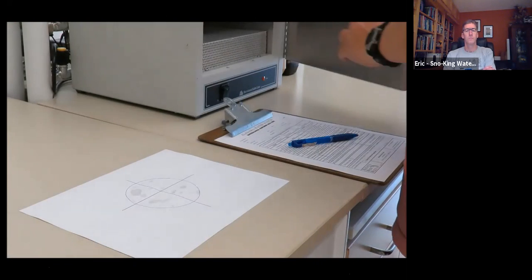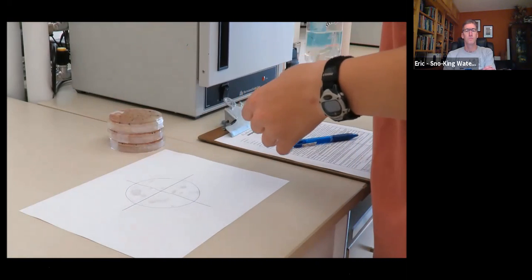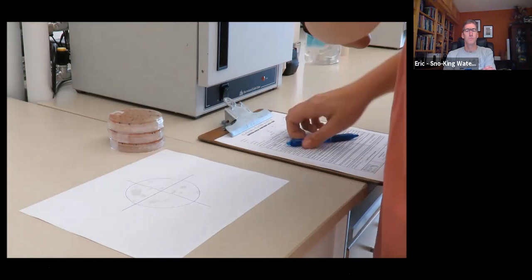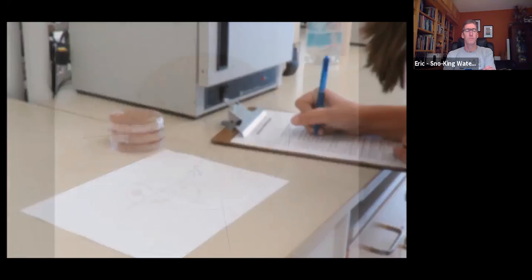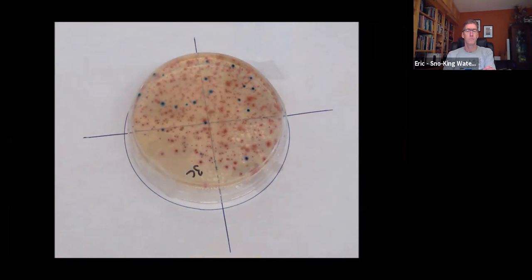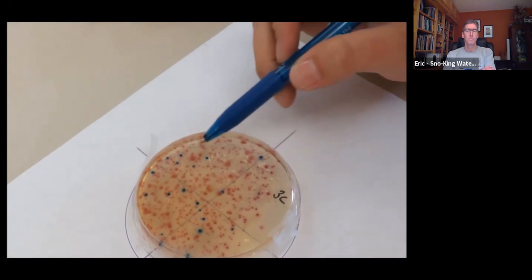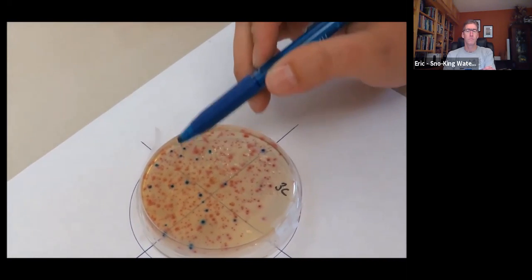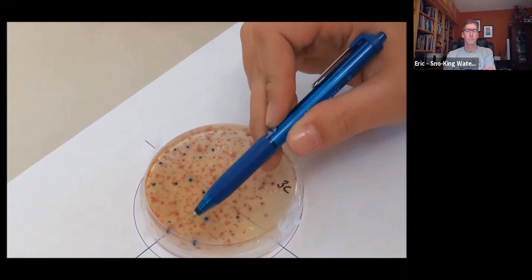Remove plates from the incubator, being careful not to spill any liquid. Be sure to record the incubation period, which is optimally between 30 and 34 hours. When counting the number of colonies, it is helpful to use a white sheet of paper to split the plates into quadrants. Count all blue to purple colonies on each plate as E. coli. Do not count very small or pinpoint colonies smaller than the period at the end of a sentence.